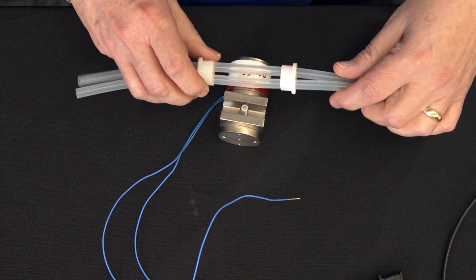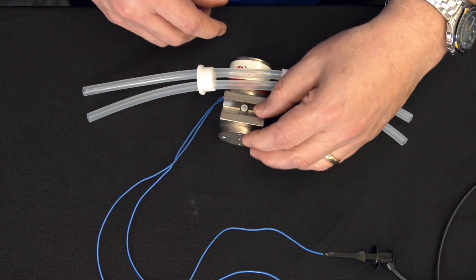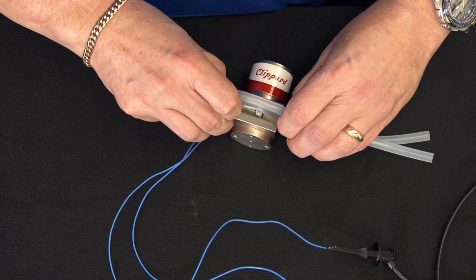To reinstall this tubing, you have to energize the valve, so you have to use a variable power supply, and push down on the little bar in the center until you can hear an audible click, then slide the tubing into its place.